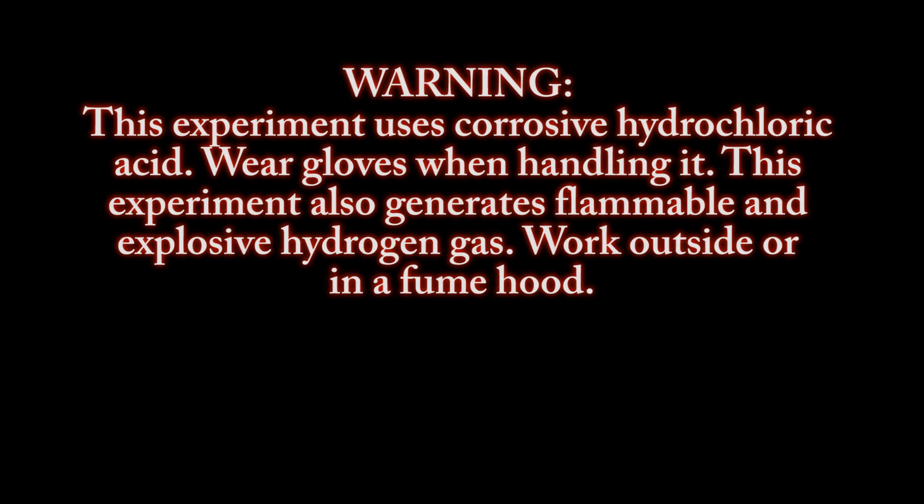Warning, this experiment uses corrosive hydrochloric acid. Wear gloves when handling it. This experiment also generates flammable and explosive hydrogen gas. Work outside or in a fume hood.